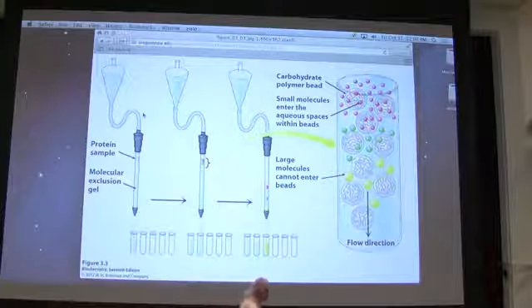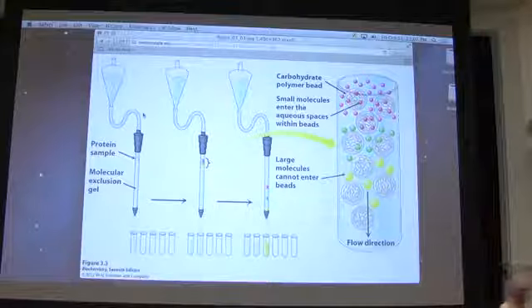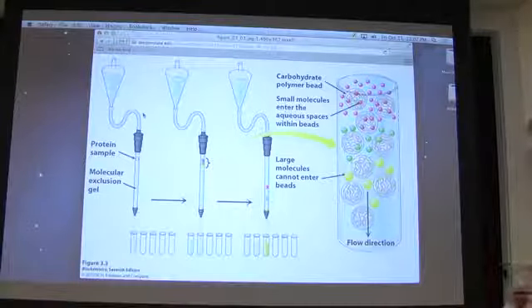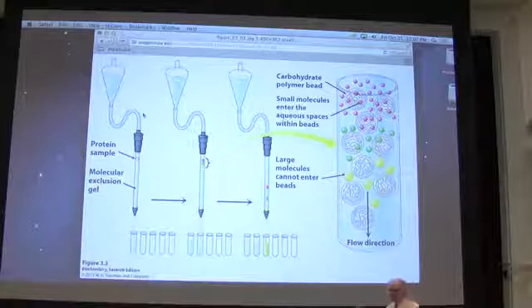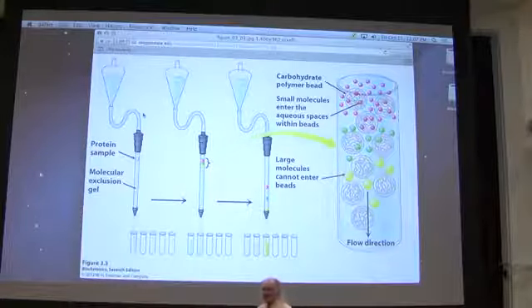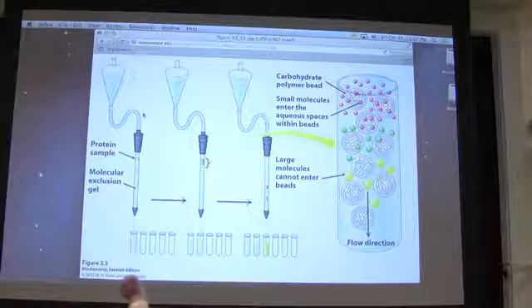Okay? So let's imagine, first of all, let's talk about what the material is. All right? So let's say I've got a mixture of proteins, and I've got some proteins in there that have a molecular weight of about 5,000, which wouldn't fit through a dialysis tube. And I've got other proteins that have a molecular weight of, let's say, 80,000, which also wouldn't fit through a dialysis tube. All right? So I can't use dialysis to separate those. I've got to find some other way to separate those proteins from each other.